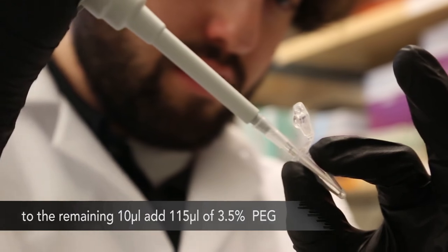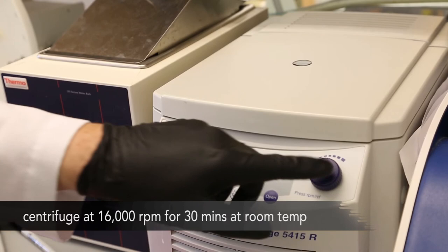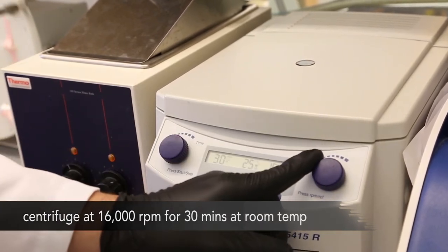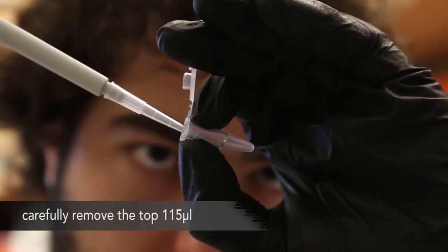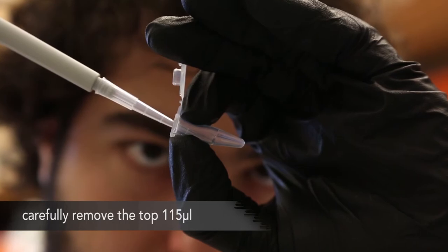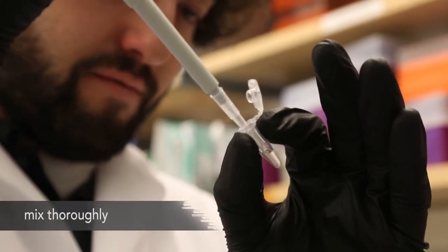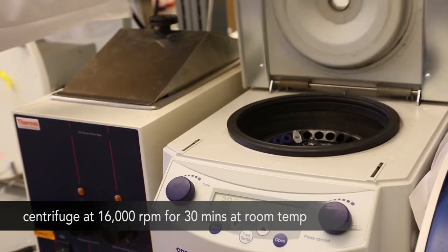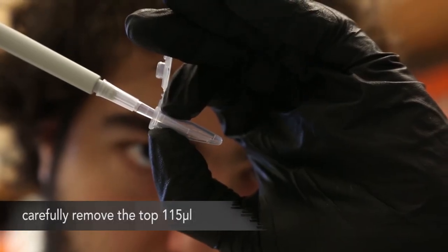To the remaining 10 microliters, add 115 microliters of 3.5% PEG and mix thoroughly. Centrifuge at 16,000 RPM for 30 minutes at room temperature. After centrifugation is complete, carefully remove the top 115 microliters. To the remaining 10 microliters, add 115 microliters of the 3.5% PEG and mix thoroughly. Centrifuge again at 16,000 RPM for 30 minutes at room temperature, and carefully remove the top 115 microliters. The remaining 10 microliters should have the hybridized DNA scaffold, free of any detectable amount of free-floating oligonucleotides.